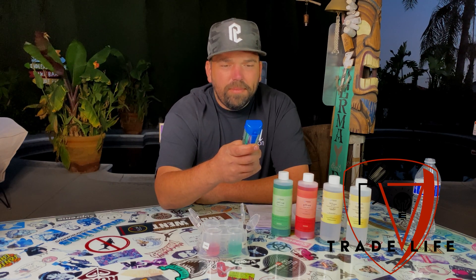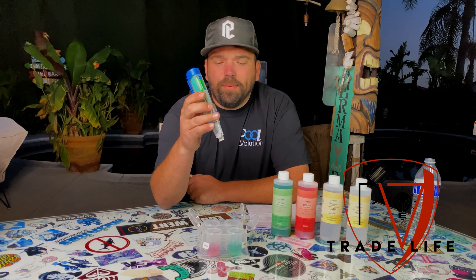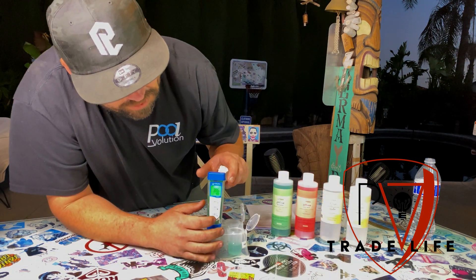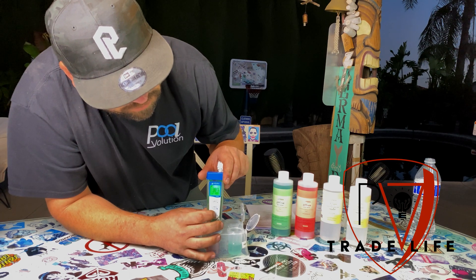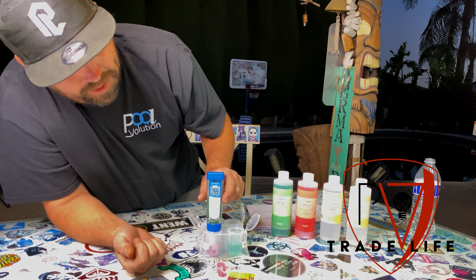Now that we did the one-point, we're going to do the two-point calibration. We're going to hit calibrate again. It's the same green light, and now it's asking for the pH 4 solution. So we're going to dip it in the 4 solution. We got the smiley face — same thing, hit enter, it's the same button. Take it out and you're good to go. Just make sure you rinse it.